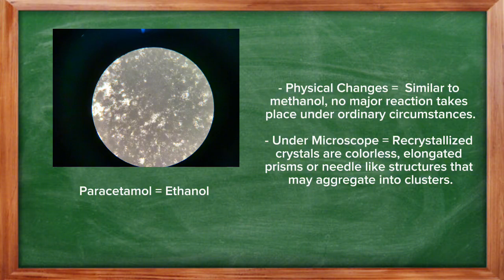Under the microscope, the crystals are colorless, elongated prisms or needle-like structures that may aggregate into clusters.